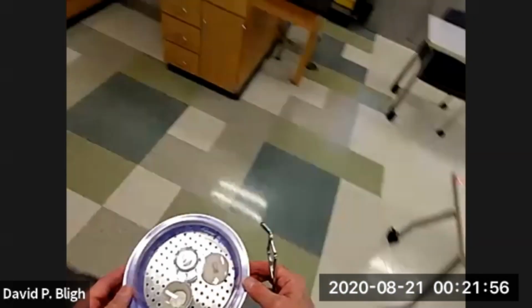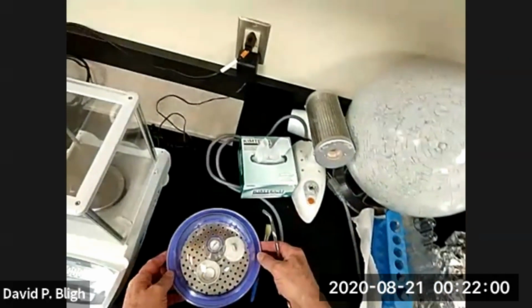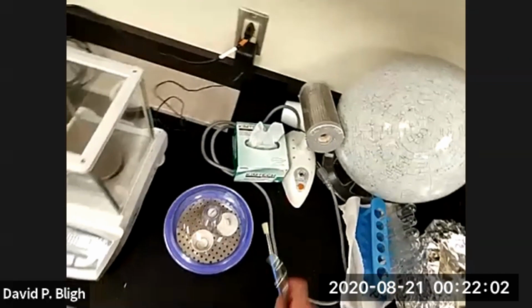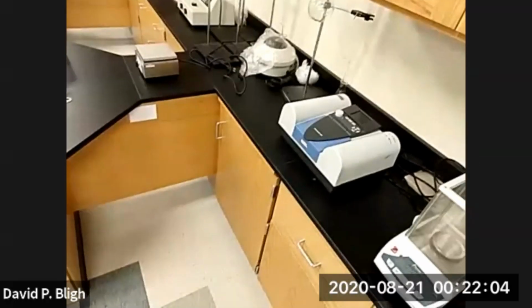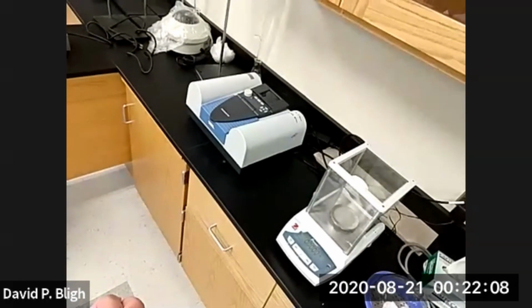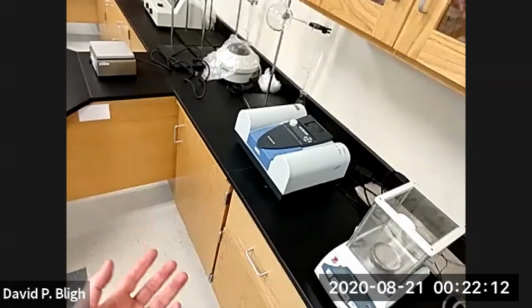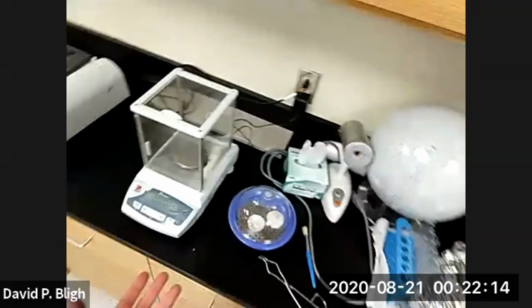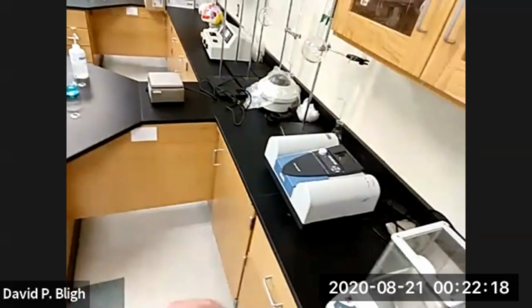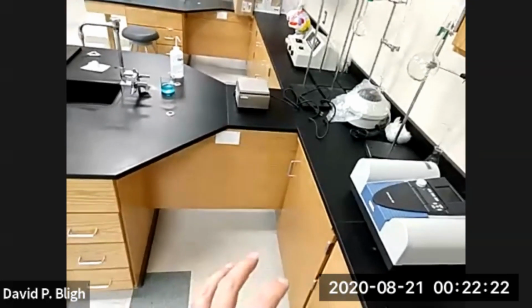The nice thing about sodium hydrogen carbonate is since the water was extracted from its molecular structure, it's more difficult for that water to return if we expose it to the atmosphere. It can still absorb water, right? The water can cling to the particles, but they won't go back into the molecule the way they were beforehand.